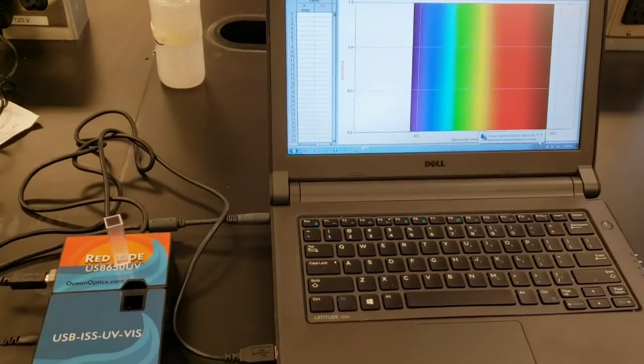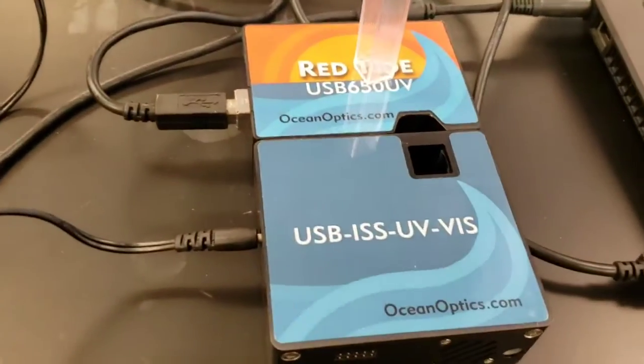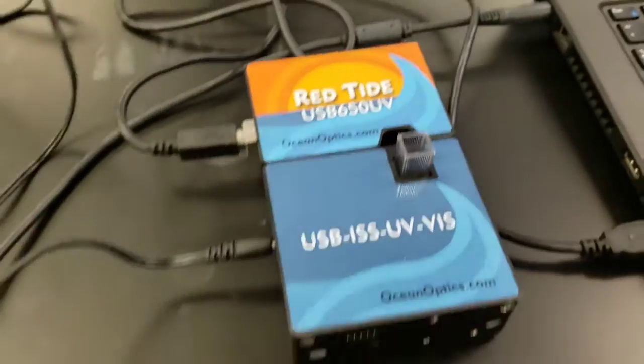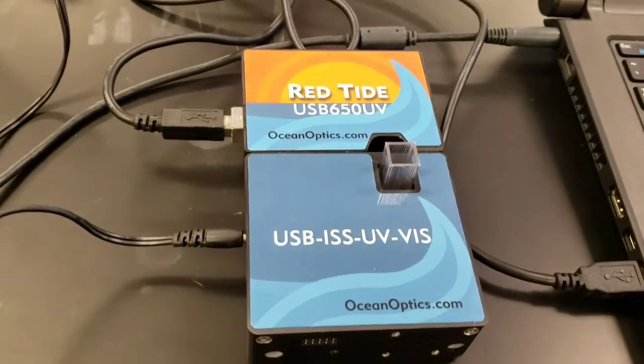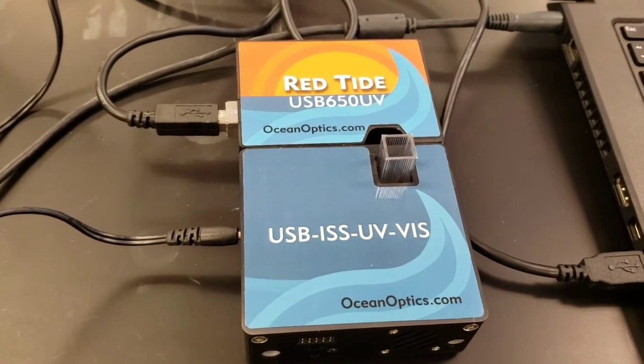This is what a 21st century spectrophotometer looks like. It's just a small USB device, still takes the same sample, but does not contain any of the complicated optics. It's all done by computer chip.